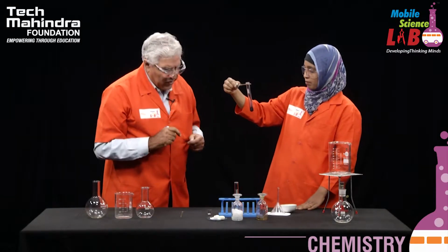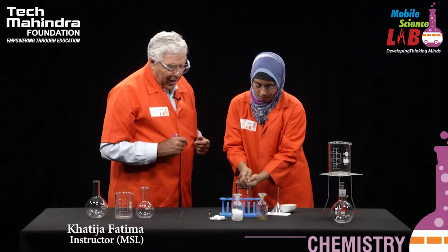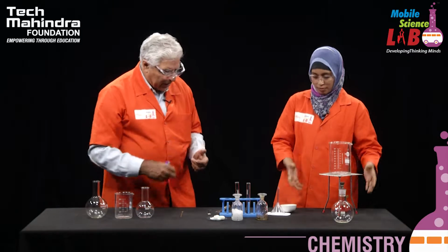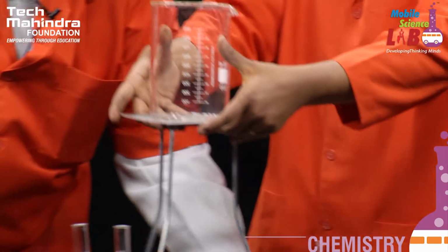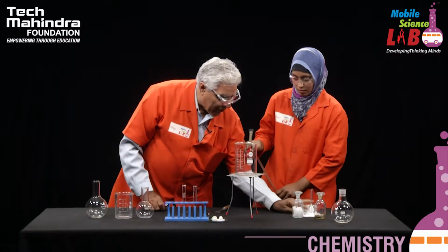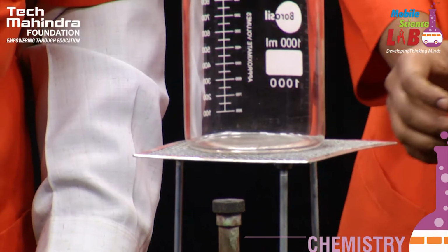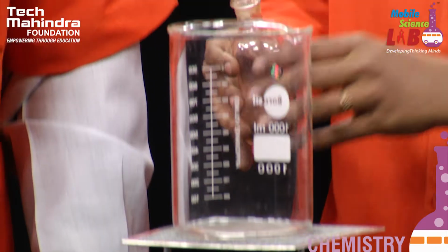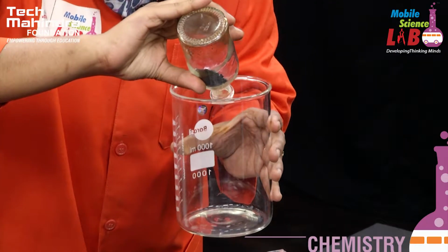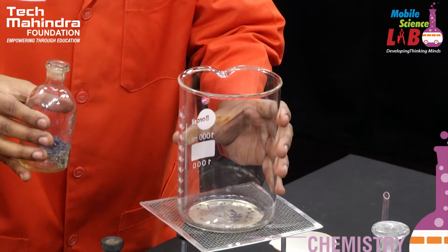Now we will do the same experiment with the help of a little larger apparatus. We will make use of that burner. Just bring it into the center. For this we will need the burner, of course. Add the iodine. Enough, sir? I think so.